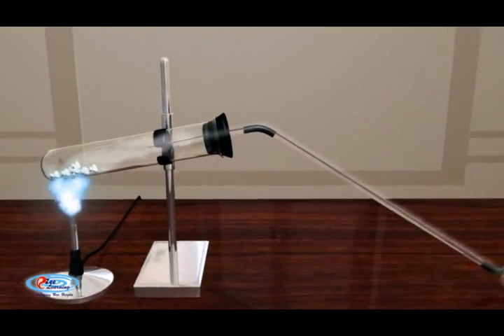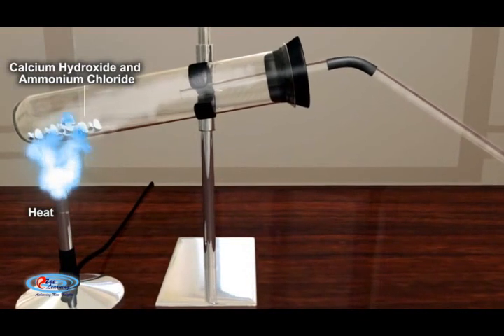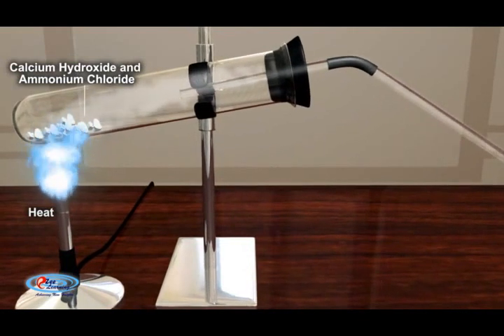The tube in which ammonia is generated is fixed in a slanting position to prevent the water formed from running back and cracking the whole tube. It is lighter than air.